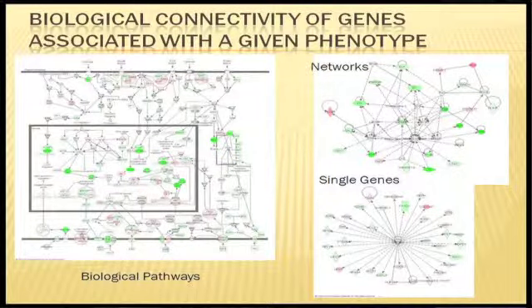One of the cool things, and this has been a more recent development, is you can generate these networks. So here we're grouping genes associated with similar biological functions. Here we're just associating them if any biological connection exists. Typically these networks have a limited amount of genes that they'll connect. They're also called interactomes, but any kind of biological connection is drawn here. And so when I generate my list, I want to see a lot of these, because I think these genes are connected and they are going together to perform a particular function, okay?